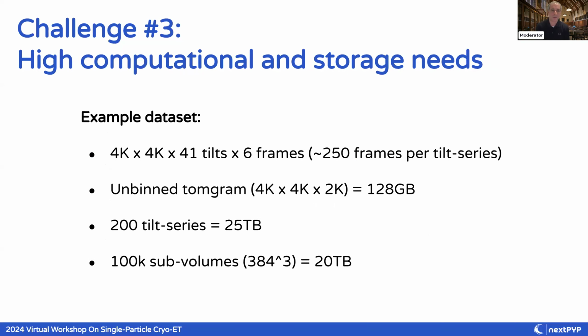The third challenge, which is also very important and one that we very heavily focus on when developing nextPYP, is the high computational and storage needs of these Cryo-ET workflows. Maybe the best way to illustrate that is to give you one example. If you're using a Falcon 4i camera that produces images that are 4K by 4K pixels, and you're taking a tilt series with 41 tilts, and each tilt has 6 frames, you're talking about 250 frames for one individual tilt series, which doesn't seem like that much. 250 micrographs we do routinely in single particle cryo-EM, but that's only the raw data, right?